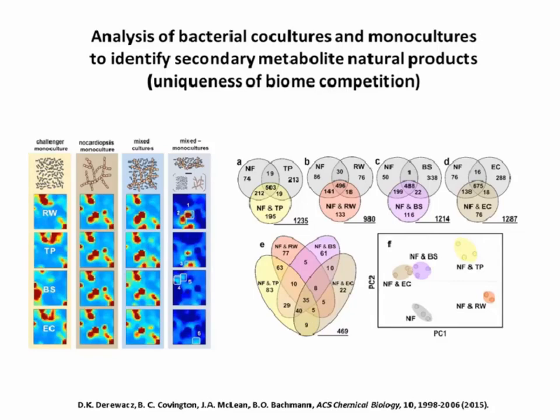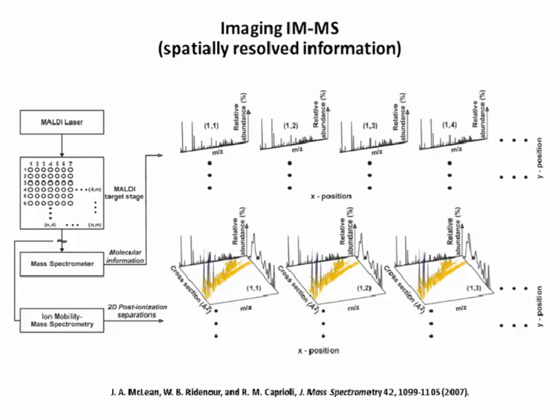Now, all of these approaches required something like a static sample, and that is using tissue culture plates and standard cell culture conditions, scraping the culture, and then analyzing just those molecules, but losing all of the spatial context. So for approximately 10 years, we've been working on imaging mass spectrometry approaches combined with the ion mobility experiment. Now, this places some significant demands on the informatics as well.